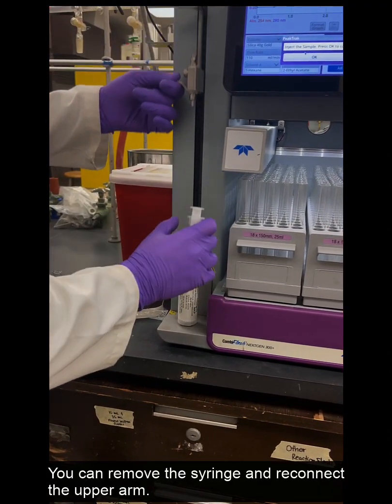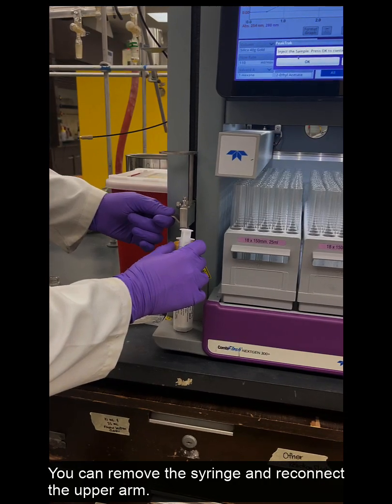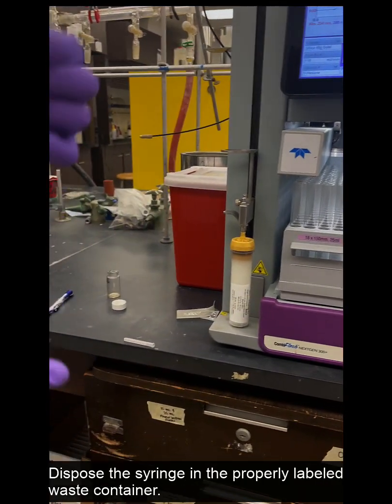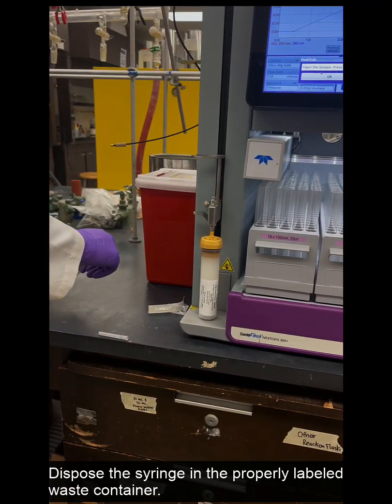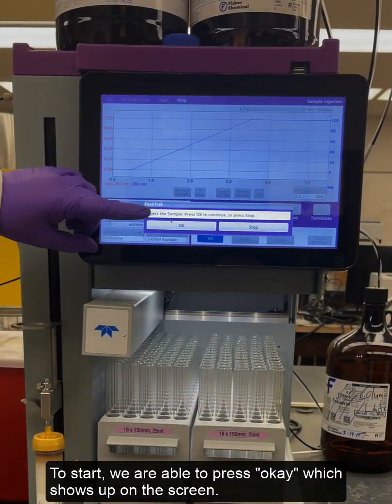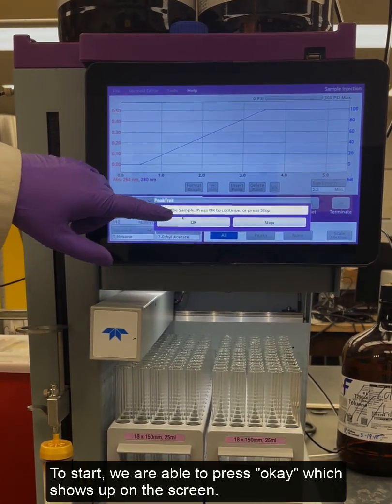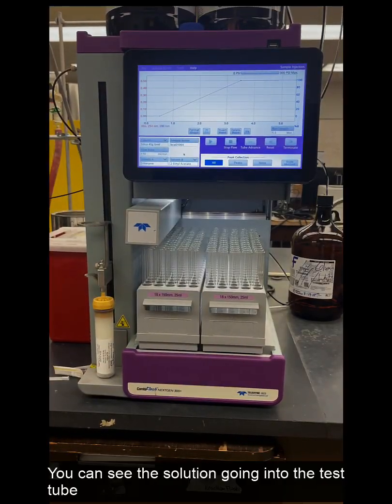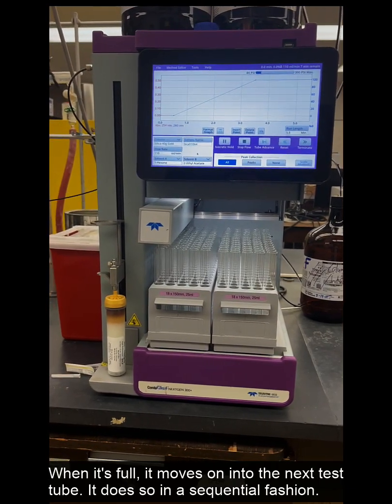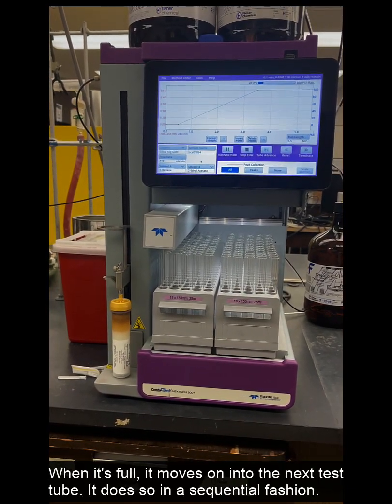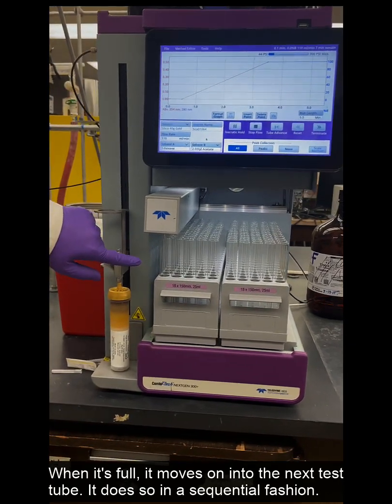You could remove the syringe, reconnect the upper arm, and dispose of the syringe into the properly labeled waste container. To start we are able to press OK that shows up on the screen. You see the solution going into the test tube, and when it's full it actually moves on to the next test tube and it is so in a sequential fashion.